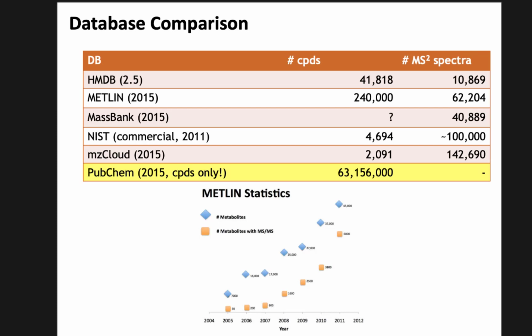The question is now, how can we find data in there? And one essential part is that we also start sharing data. I mentioned that at GNPS already. If we all put this data together, then every lab that has 500 spectra of their pet compounds and thinks they're immensely valuable, misses that if everyone would share them, they wouldn't have 500, but they would have 50,000 or 100,000.